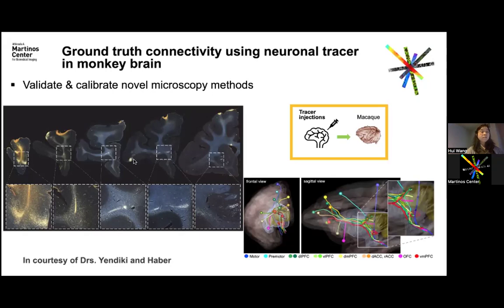On the left is tracer. They inject tracer from different cortical regions, and the tracers are fluorescent. They can look at where the tracer goes, lighting up in each individual slice. It's slice-based. They find corresponding locations, and from there they can make this trace schematic showing the trajectory of the fiber tracks by following the tracer locations.